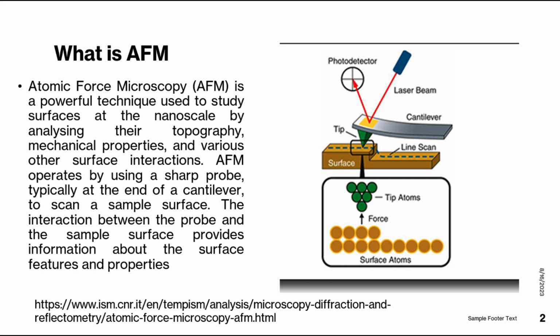Atomic force microscopy, AFM, is a powerful technique used to study surfaces at the nanoscale by analyzing their topography, mechanical properties, and various other surface interactions. AFM operates by using a sharp probe, typically at the end of a cantilever, to scan a sample surface. The interaction between the probe and the sample surface provides information about the surface features and properties.